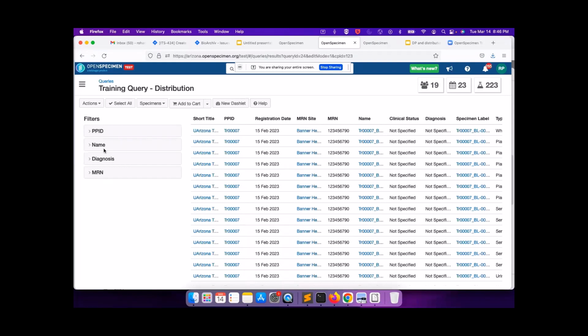Suppose you document clinical diagnosis for every specimen or every visit of a participant, so that you know that there is a tumor tissue, or the person with the diagnosis of XYZ, let's say some kind of leukemia or sarcoma, their pathological status is benign, malignant, all such things can be configured to be pulled over here.